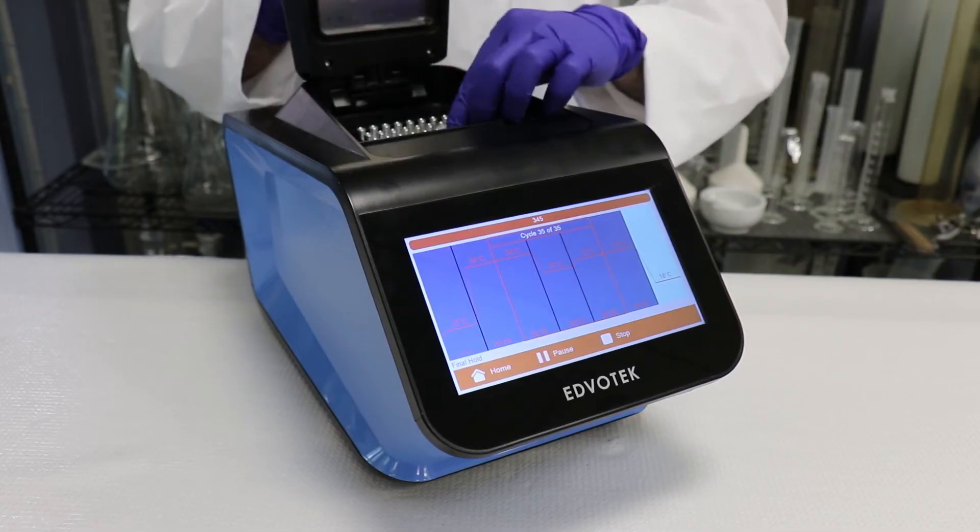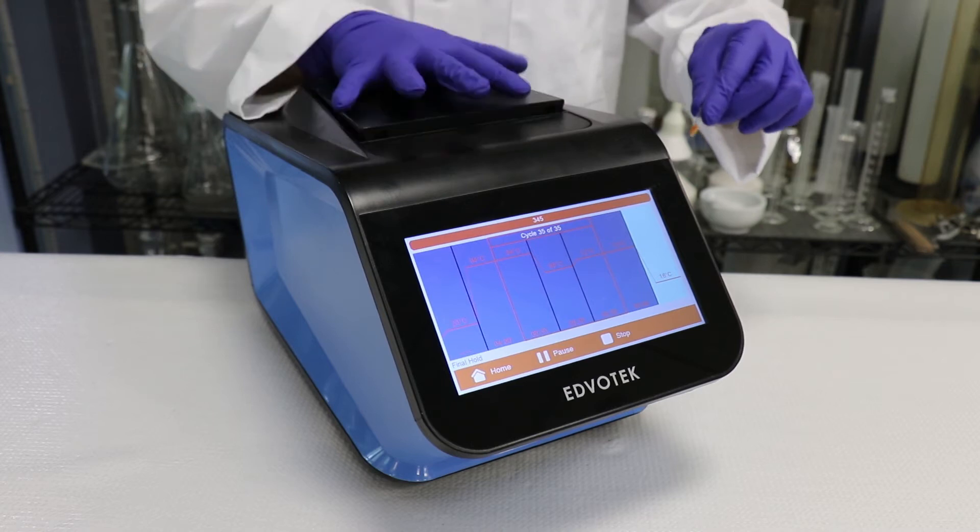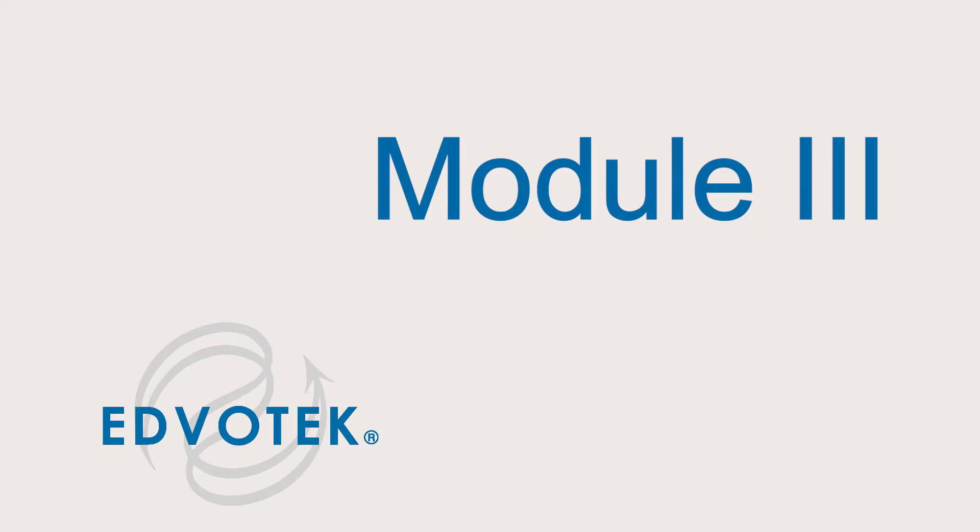Once complete, the sample can be frozen until you are ready to perform the next module.